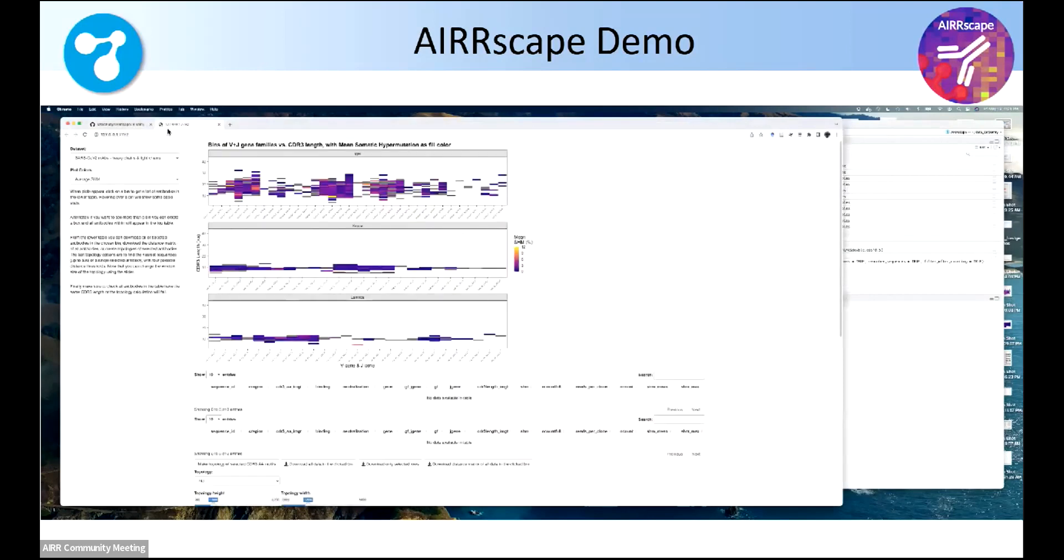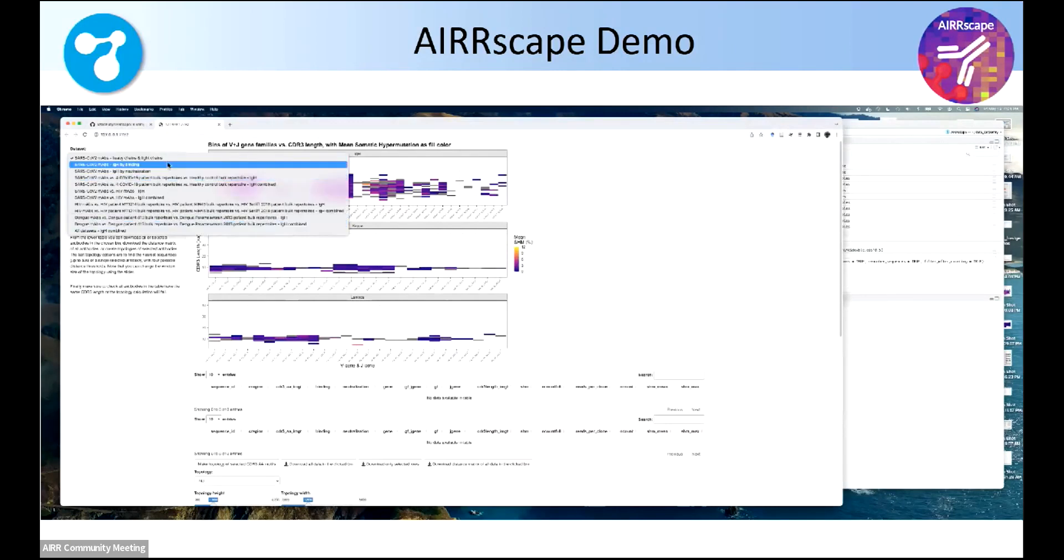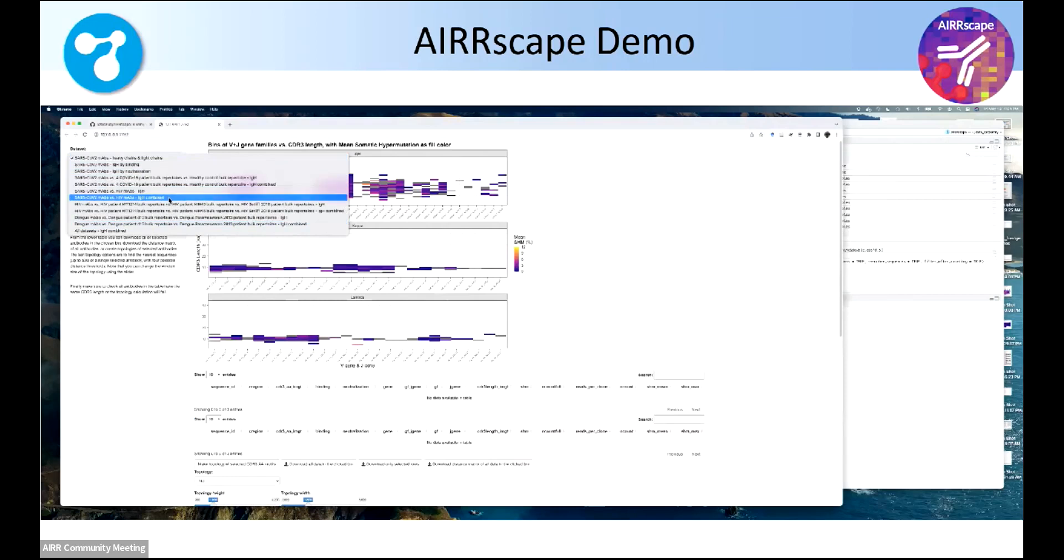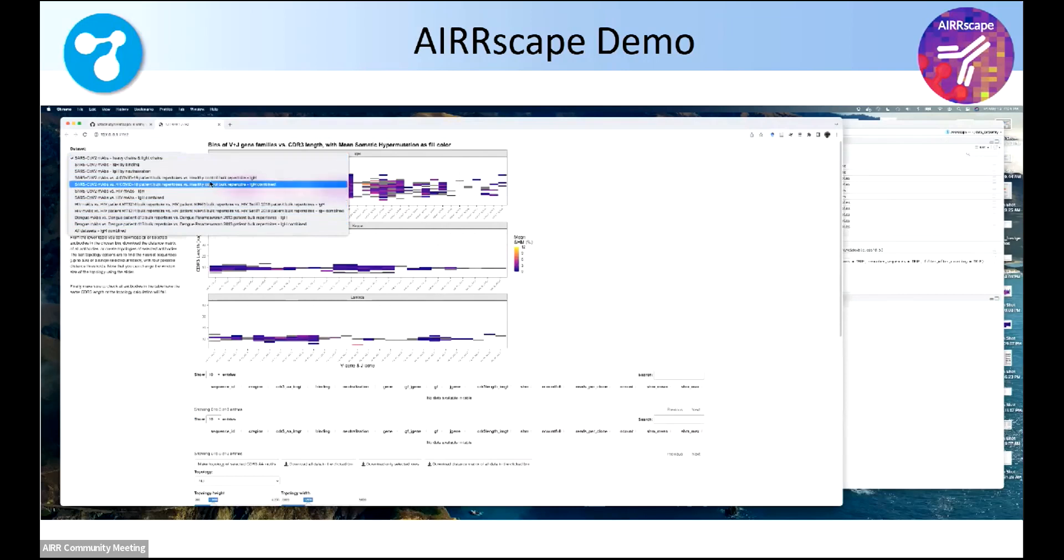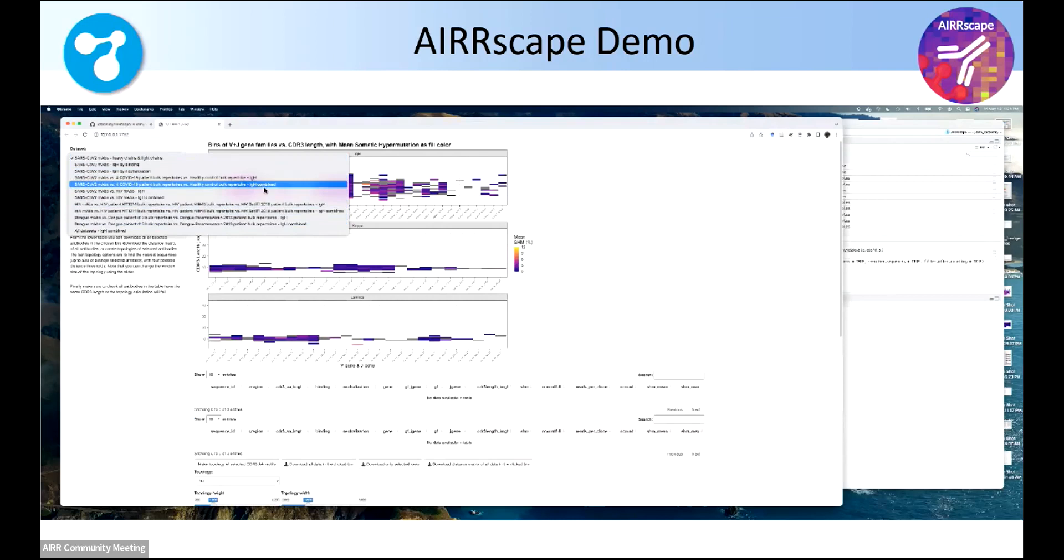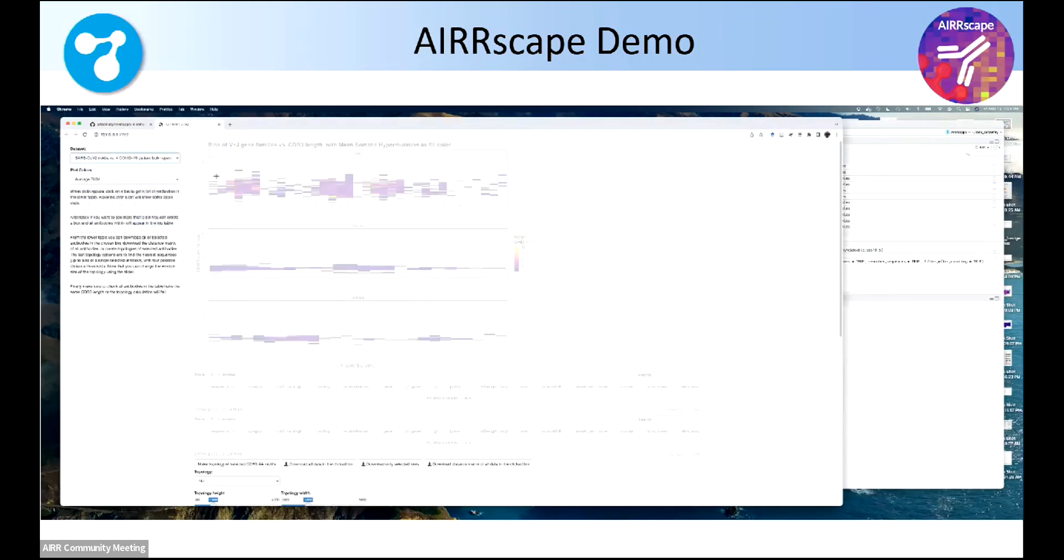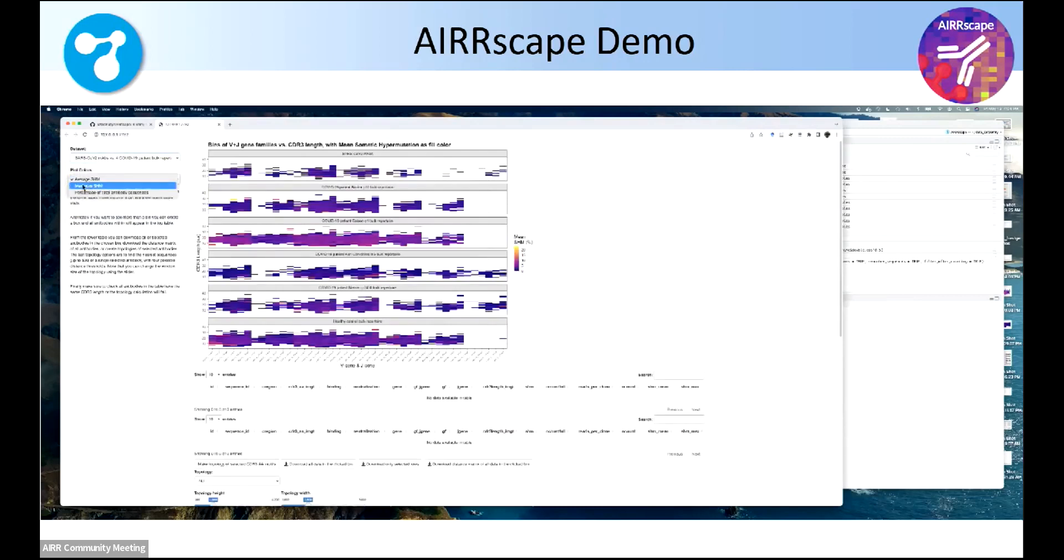In this case, there's about eight examples here, a bunch of SARS-CoV-2. So that's on the left-hand side, choosing which data sets you want to look at. There's some dengue ones in there. There's some HIV ones in there. Many of them, if you're comparing multiple repertoires, there's an option of looking at each repertoire individually in all these facets or combined.